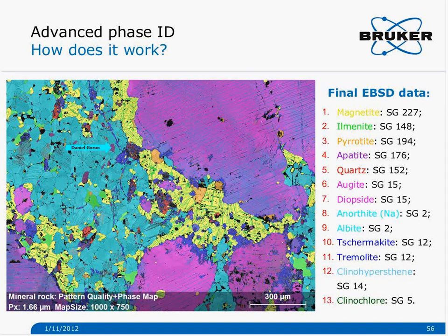And by enormous, I mean, let's say, this map was with EDS and EBSD patterns, at that particular resolution I showed you, 160 by 120 pixels, 12 gigabytes. That is a lot of space. But if you don't keep the patterns, that will go down to around 600 megabytes.